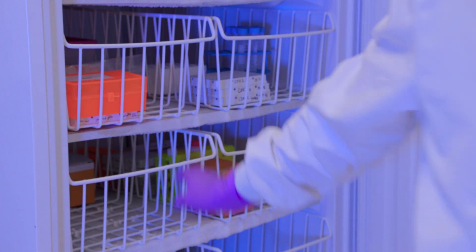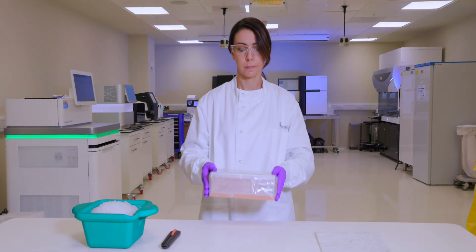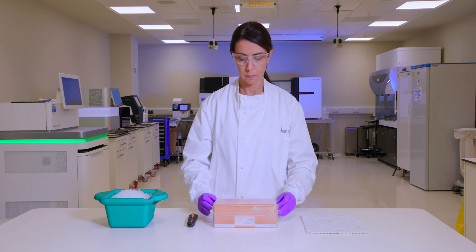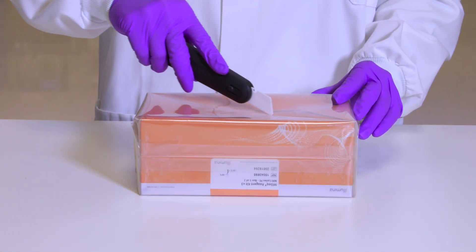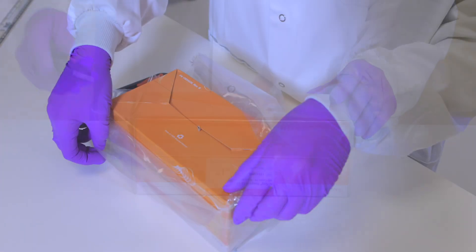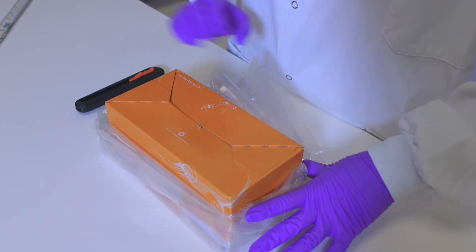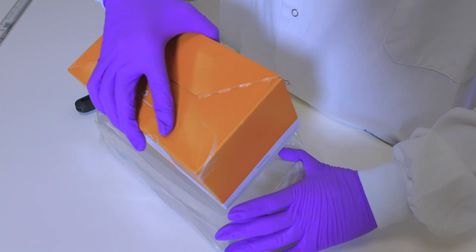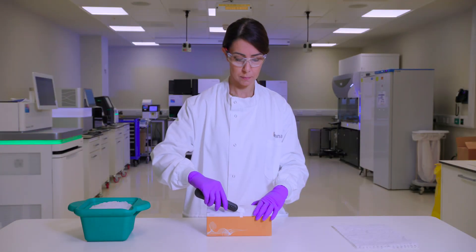To prepare the reagent cartridge, first remove it from freezer storage and unbox the cartridge.